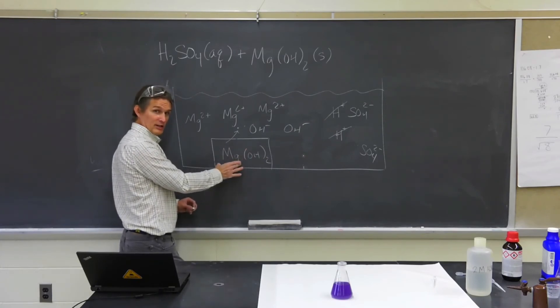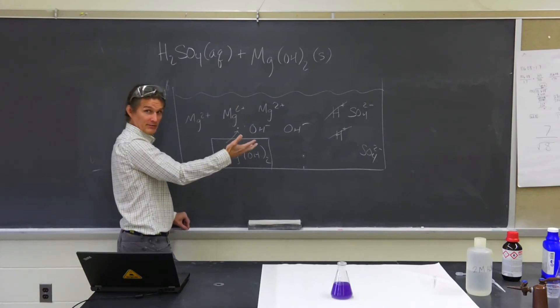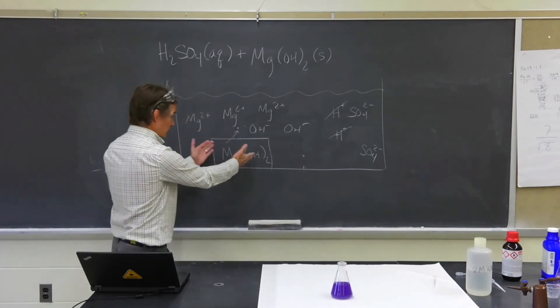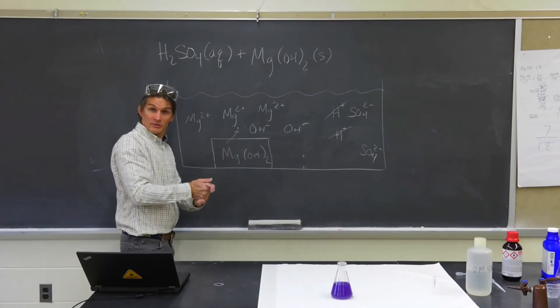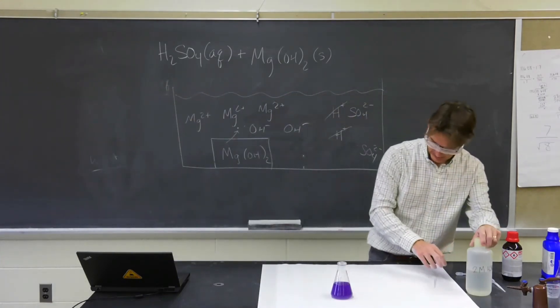This process can happen over and over again until we run out of magnesium hydroxide. When all the magnesium hydroxide has been neutralized and adding acid has nothing to react with, it should stay red. And instead of being cloudy, it will no longer be cloudy because all the solid is gone — it should go to clear. Let's see — let's continue to add some acid.